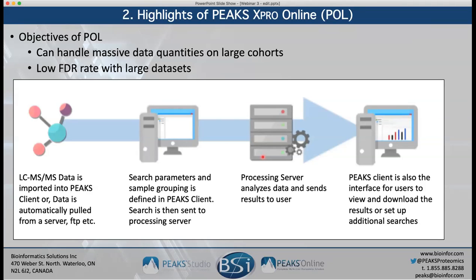Essentially all the work happens there, and you direct all this through a PEAKS client. The PEAKS client is generally a web browser.